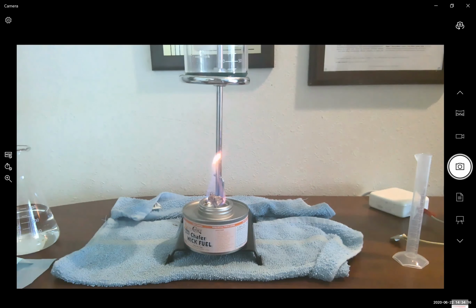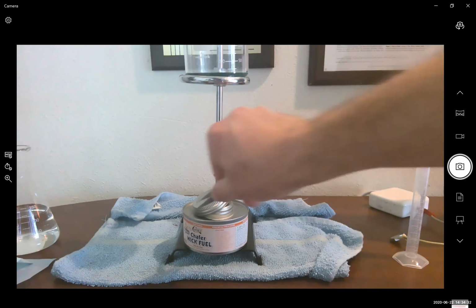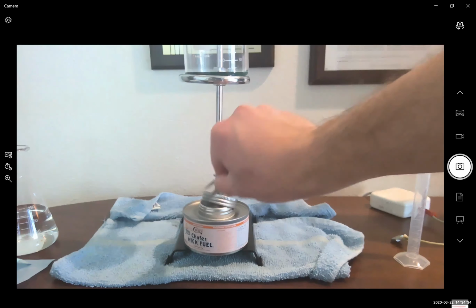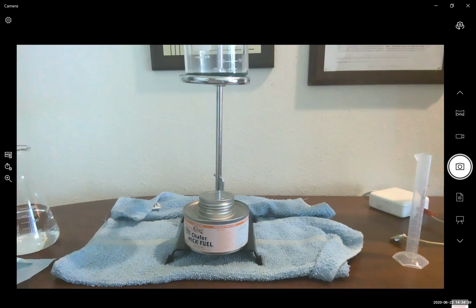Now, as it's approaching the 1 minute mark, we're going to extinguish the flame by taking our forceps, holding the cap with our forceps, and then bringing the cap above the flame. Like so. We are smothering the flame of its oxygen source. You're going to leave the sterno cap on its own, and you're going to let it cool.